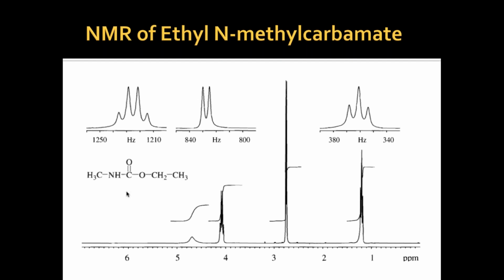As I said initially in the starting, you have to shim your sample. It's really important how you shim your sample. What is the concentration? What is the molecule? So many factors. Oxygen hydrogen is way simpler to interpret as compared to nitrogen hydrogen. Let's see here.